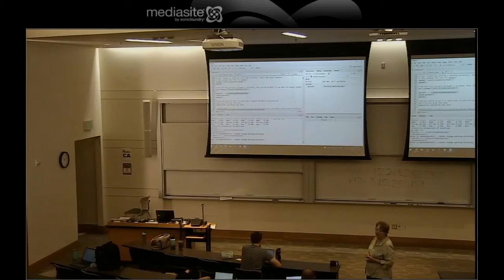Okay. So someone just asked where it is grabbing the data for iris and mtcars. Those are both data frames that already exist in R. They live in R to teach people R. You will learn how to pull in your own data soon. They start with a data frame that already exists, so you don't have to figure that part out ahead of time.